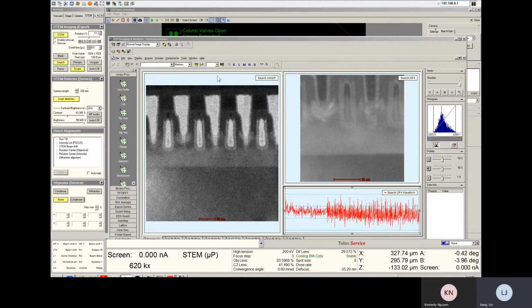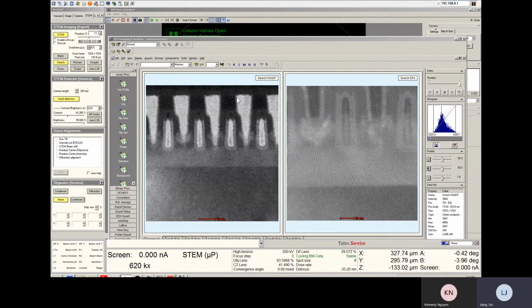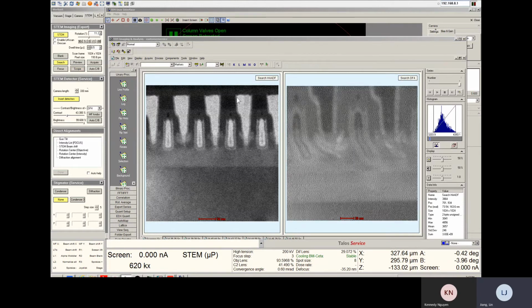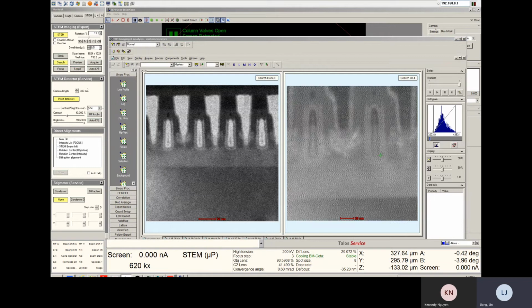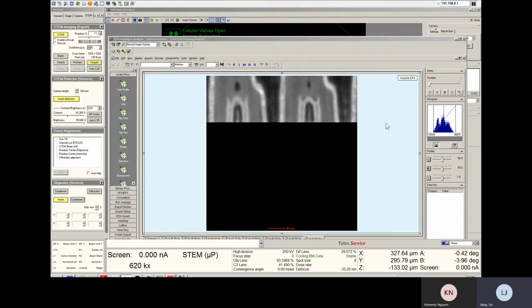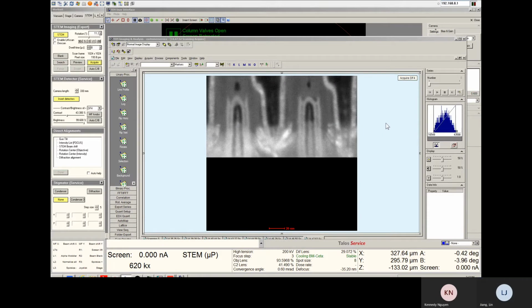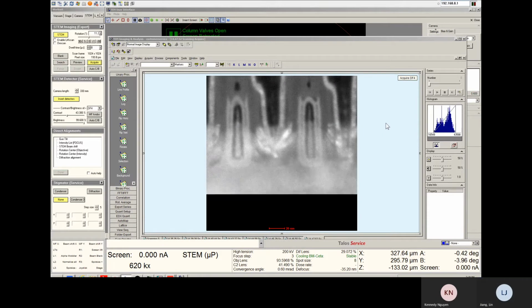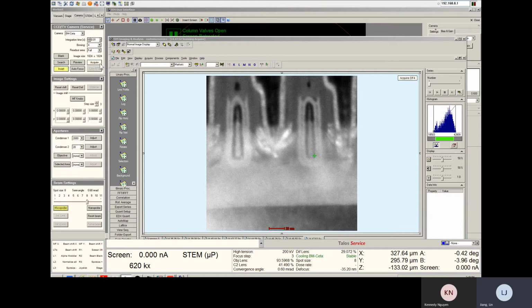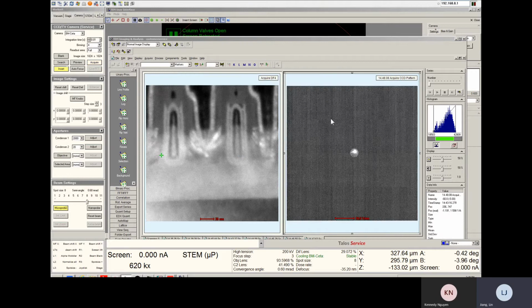And then we can move to this region. And then say acquire. Once acquire imaging, we can set up another, keep that in mind. We need to set up another diffraction. You still see the cutout, okay.